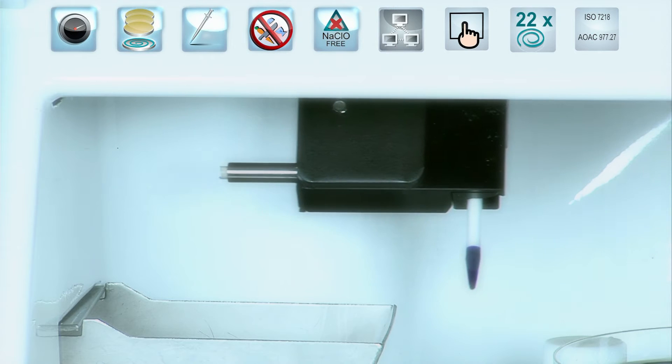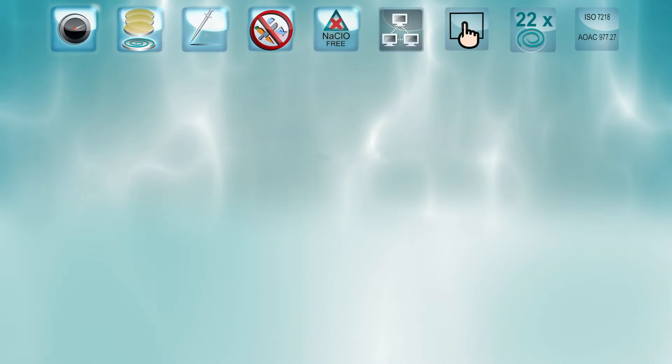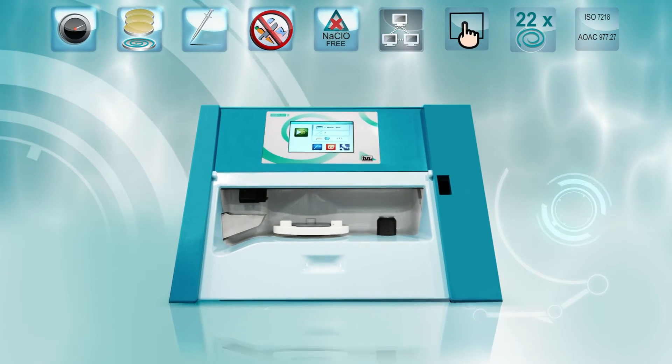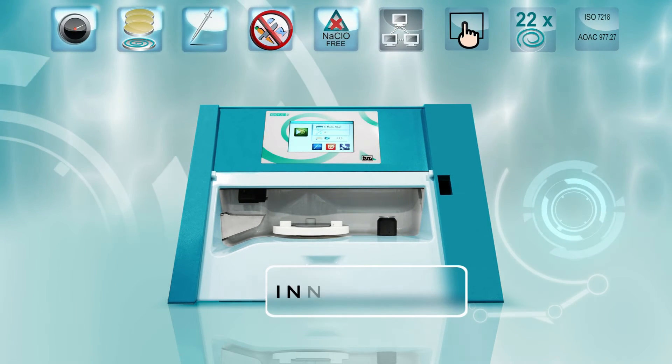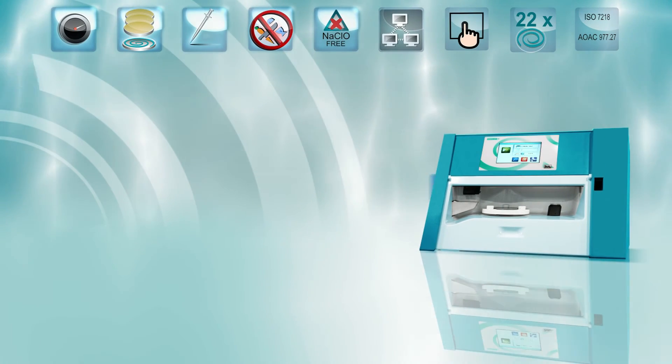After each sample is processed, used micro-syringes are released. EDIJA II is an unmatched spiral plater that pushes the outstanding standards of the first EDIJA even further by adding trendsetting innovations to spiral plating.